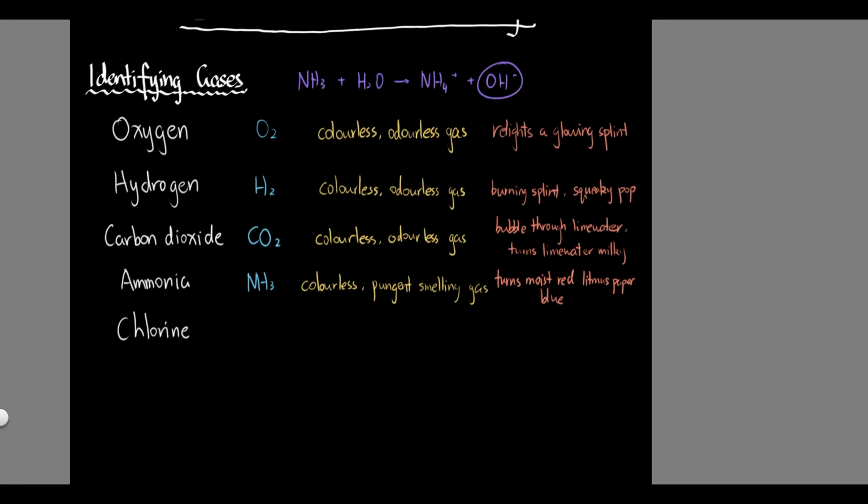So using a red litmus paper we can test for bases. But anyway, that's just an extension, and I really found it helpful. These kinds of extra stuff that are not covered in the syllabus really help me remember these results. If it helps, it helps, and if it confuses you, don't worry about it. So just remember that ammonia turns moist red litmus paper blue.